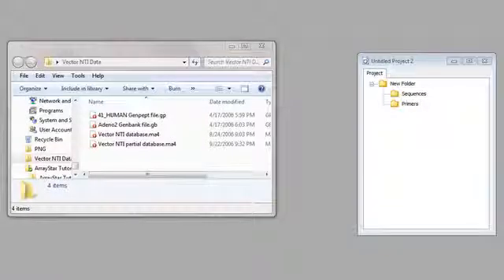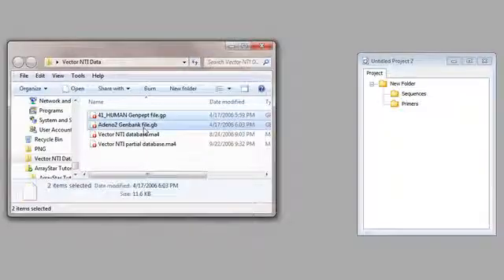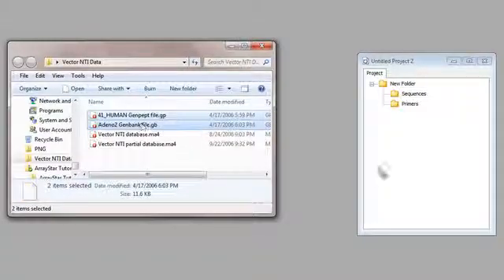I'll import my DNA and protein files by shift-clicking to select them, then dragging them and dropping them on the Untitled Project window. You can see that SeqBuilder automatically creates a sequence file for each of the Vector NTI files. Next, I'll drag and drop the files into the folder I made for them.